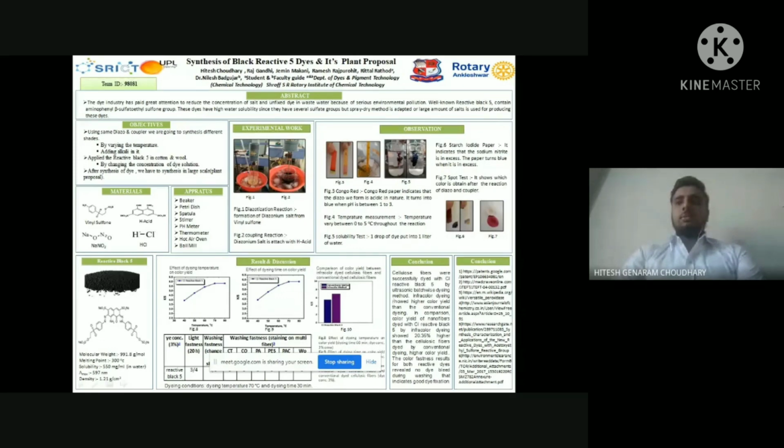Thank you, Ritul. I, Hitesh Chaudhary, would like to talk about the main objective of our project, which is that using the same diazo and coupler, we are synthesizing different shades by adding alkali and maintaining temperature. According to our project, the raw materials used are vinyl sulfone, H acid, sodium nitrite, and HCl. Apparatus required are beaker, petri dish, spatula, stirrer, pH meter, thermometer, hot air oven, and ball mill. This dye is applied on cotton and wool. Further will be explained by Raj Gandhi.